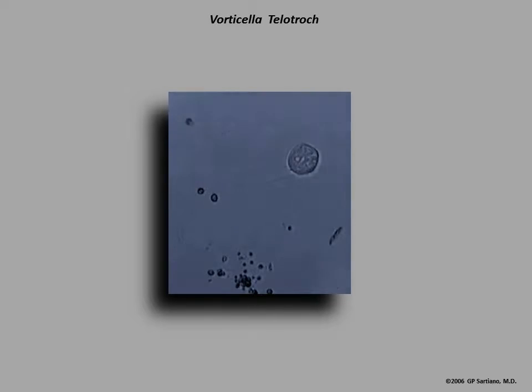Note the very long, thin, almost redundant stalk. It is myonematous and contracts quickly into a coil, somewhat flattened into a zigzag pattern by cover glass pressure. Note the identifying coarse cilia at the base of the organism's body, the location of the trochal ring of the telotroch.